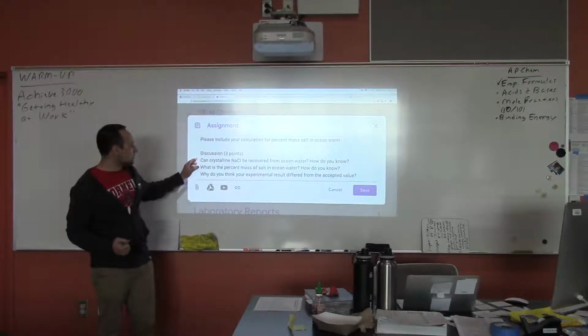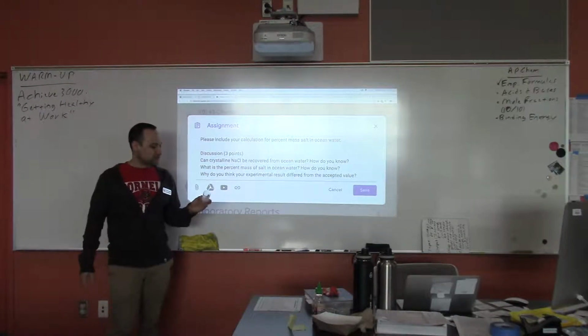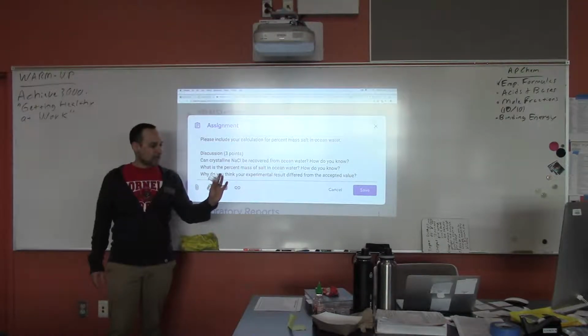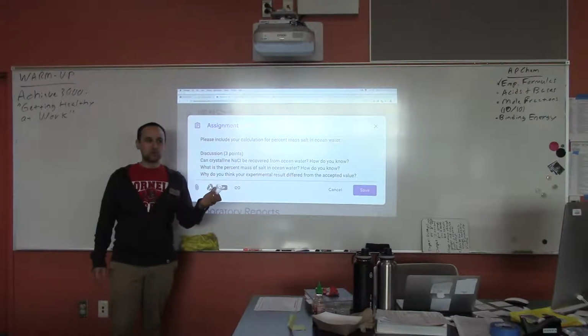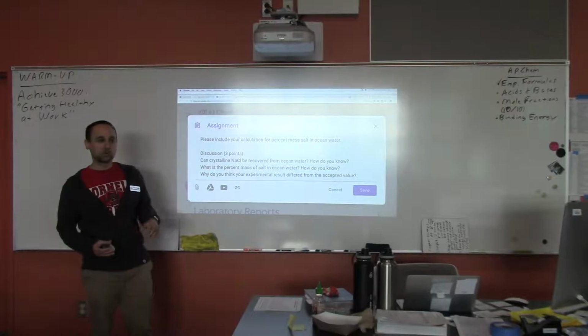So, can crystalline sodium chloride be recovered from ocean water? How do you know? One answer would be, we determined that crystalline sodium chloride can be recovered from ocean water because a powdery white substance whose appearance was consistent with that of solid sodium chloride was recovered after ocean water was evaporated from our beaker, right? Something like that would totally work.